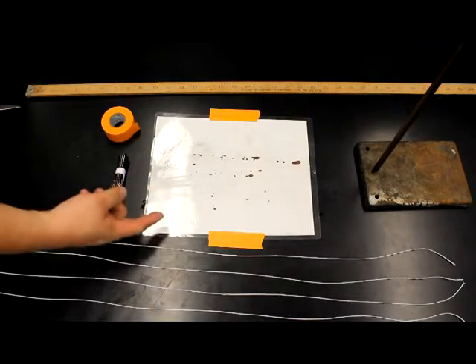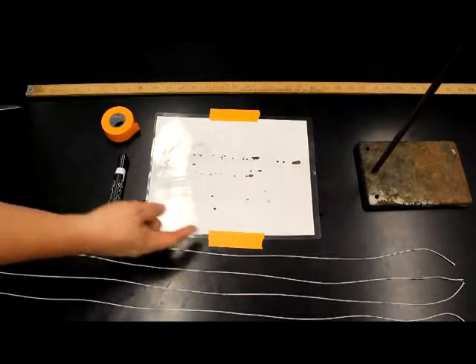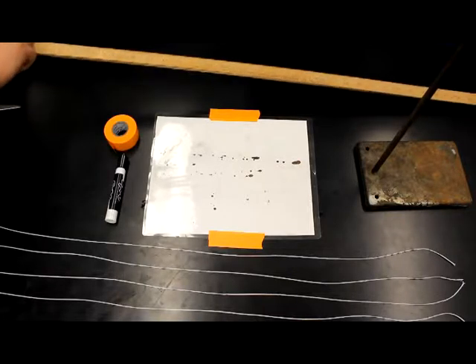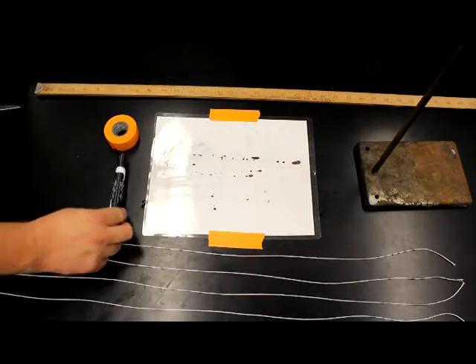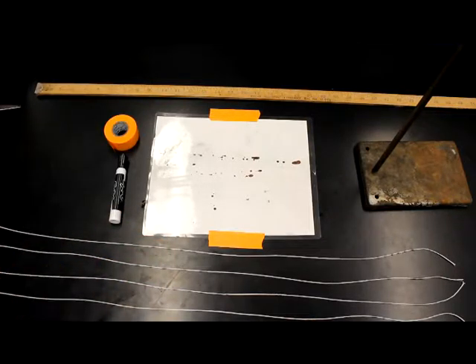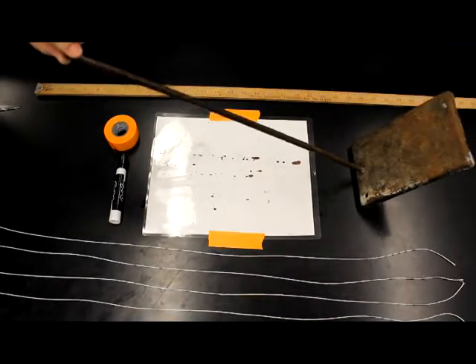You're going to need your actual blood spatter pattern, which you're going to tape down to your countertop using some form of tape. You're going to need some type of ruler that you can draw a straight edge with. You're going to need a dry erase marker. You're going to need string. Here you have 4 pieces, but in the end, you'll need 8. And finally, you're also going to need this chemistry stand or something equivalent to it.